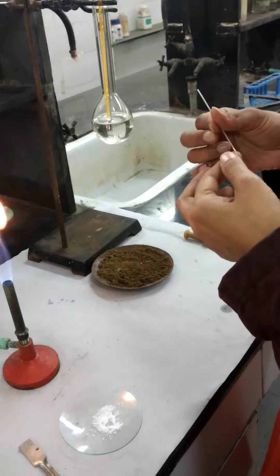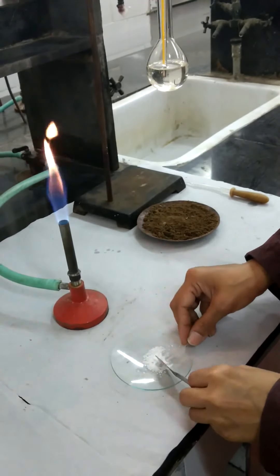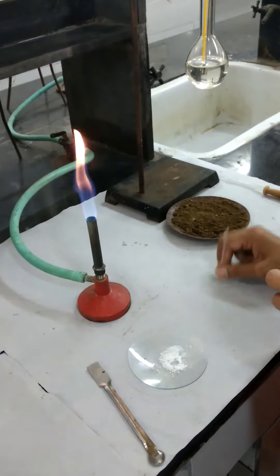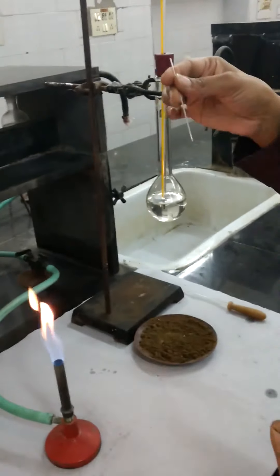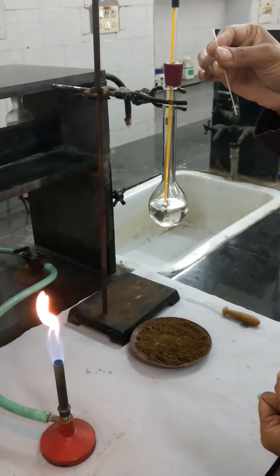This gives a sharp melting point. This is one of the procedures to check the impurity of the compound also. I have filled this sealed capillary up to half a centimeter.